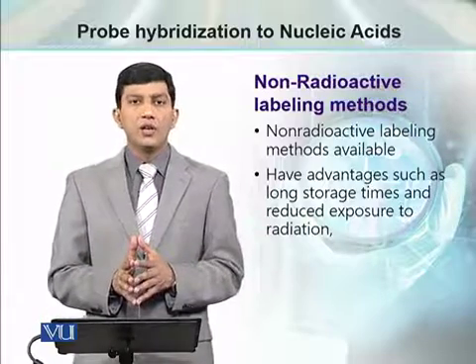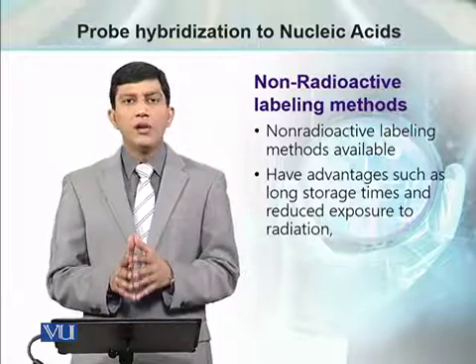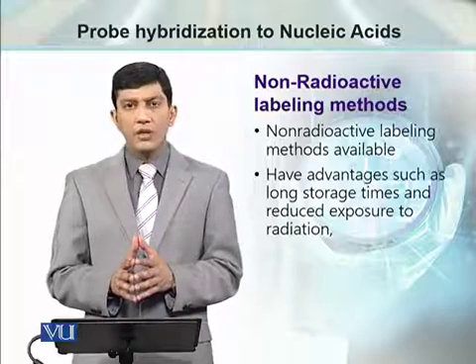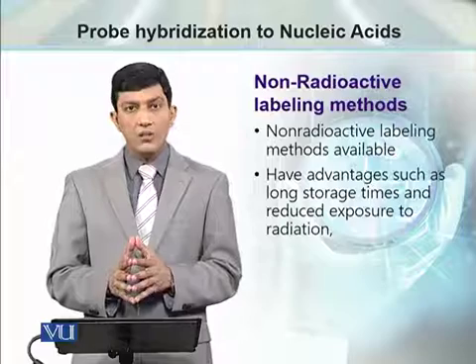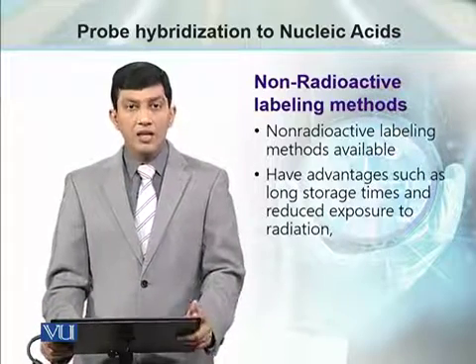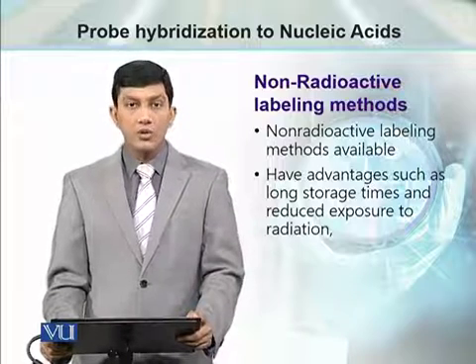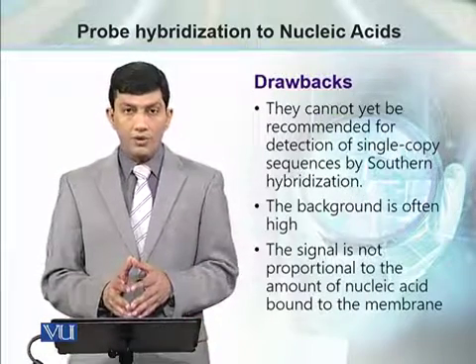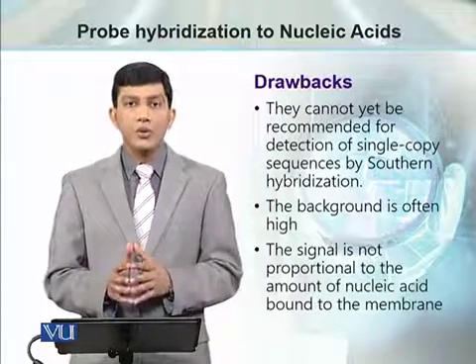Besides these radiolabeled probes, we now have some non-radiolabeled methods available. These non-radiolabeled methods have some plus points or some advantages over the radiolabeled method. For example, they need less exposure time. They have longer storage times, but at the same time, they have some drawbacks. And these drawbacks discourage us from using this non-radiolabeled method.